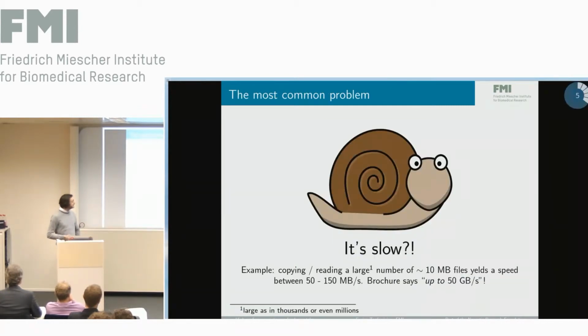Well, when stuff works as expected, yes. When stuff doesn't work as expected, not really. I think the most common problem that we have to assist our users with is that their workflow, for some reason, is not performing as expected. It's taking too long to process.